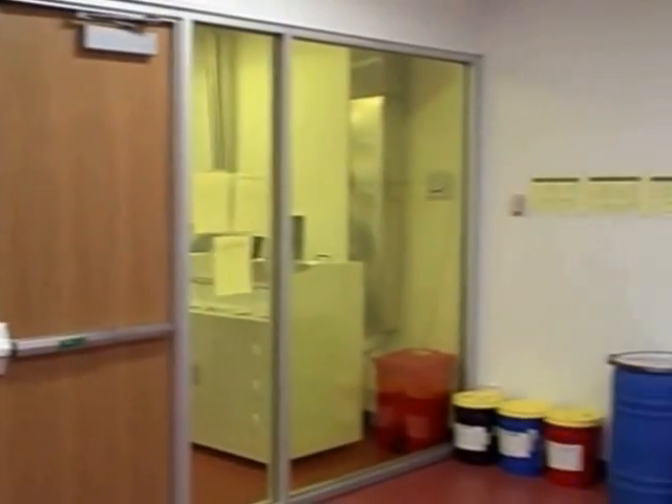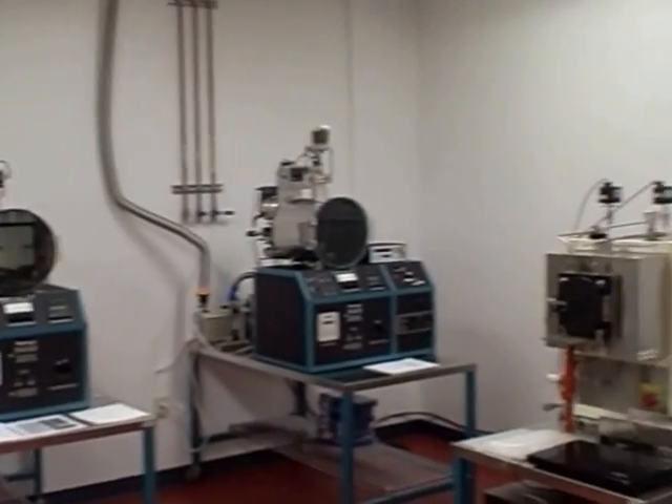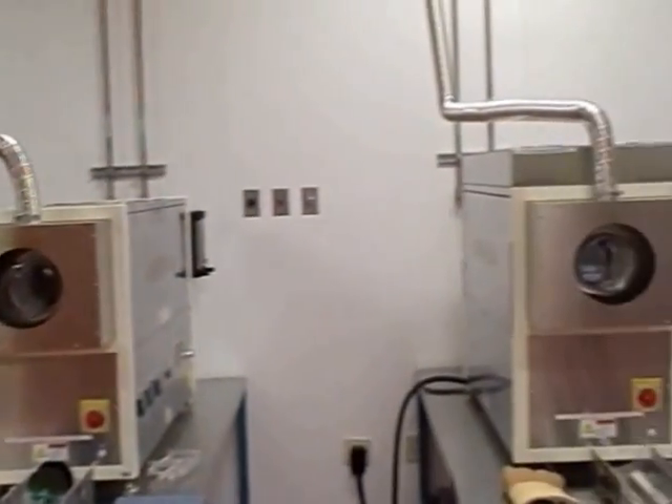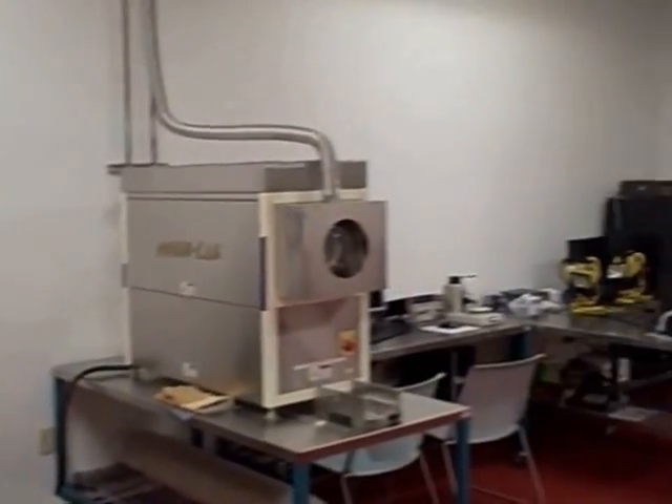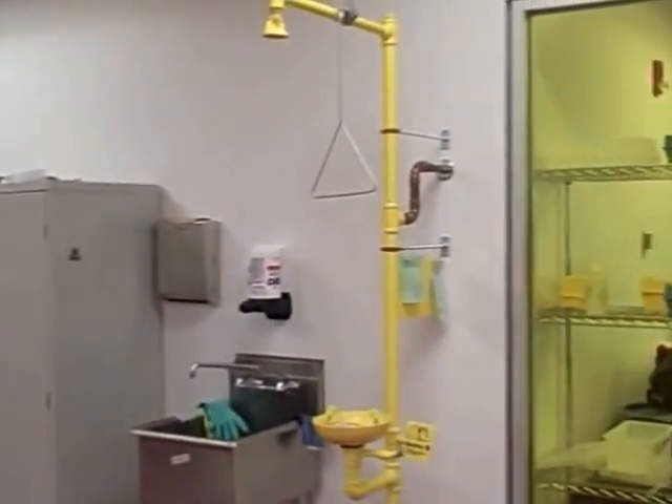It is important to know your equipment. All this protection is needed to operate the delicate machinery that is housed in this clean room. It is also important to know where the emergency safety stations are located in this room.